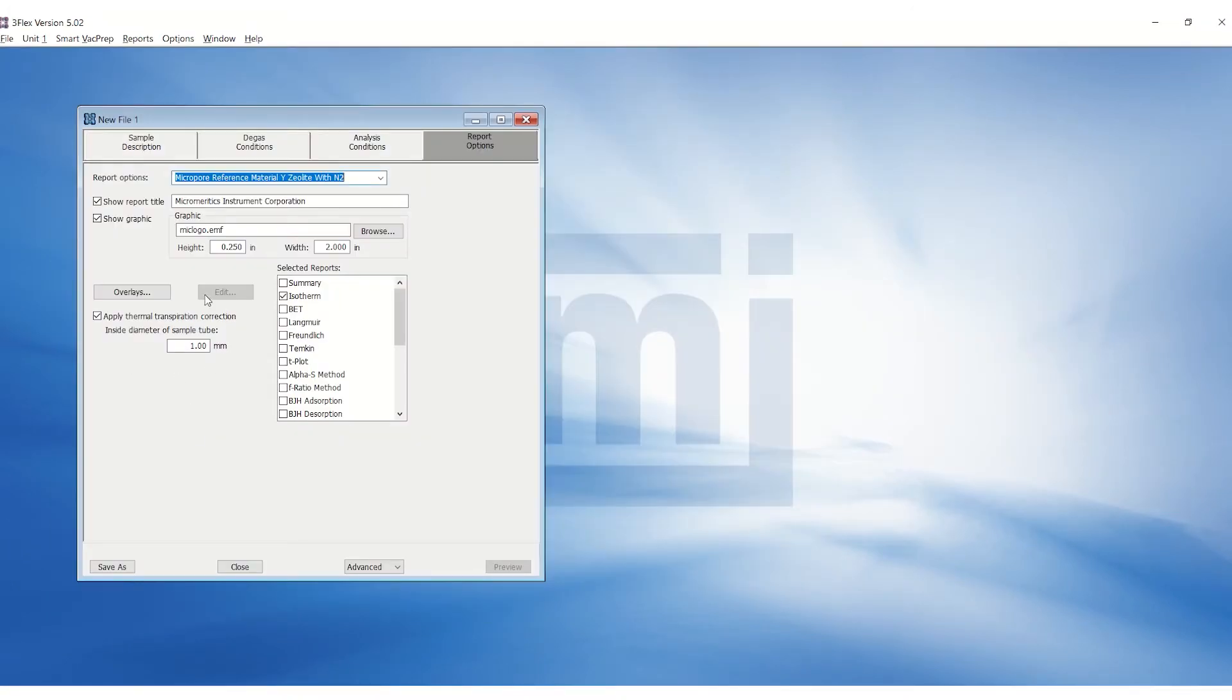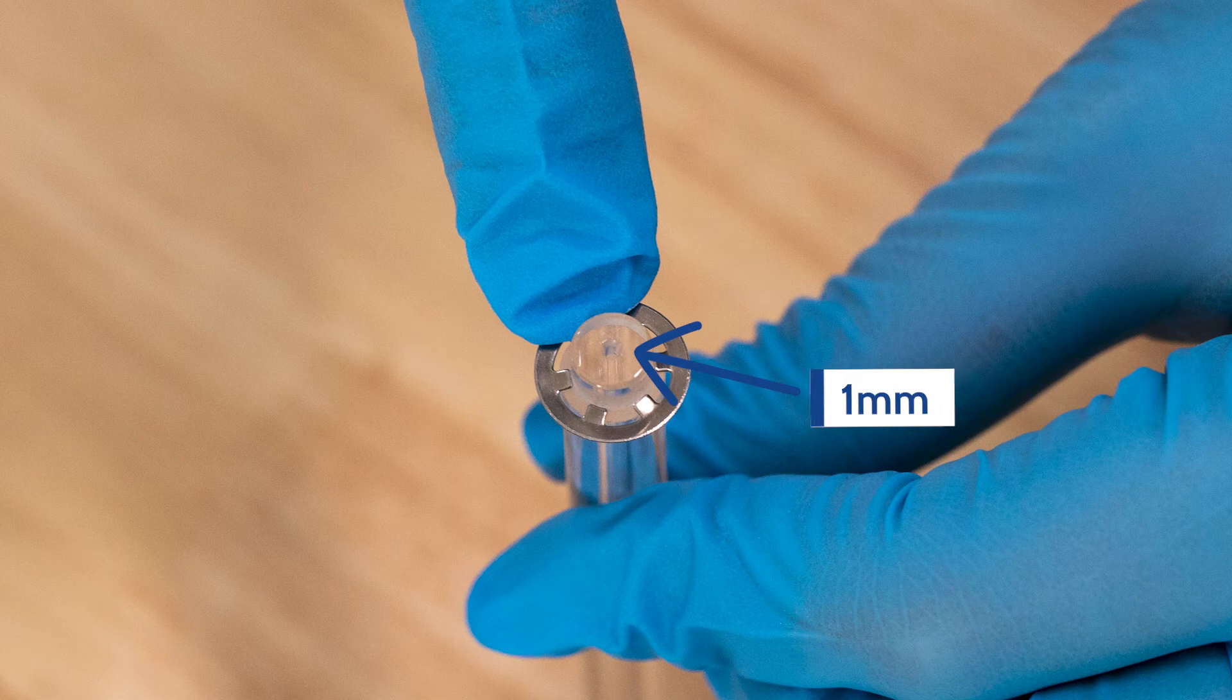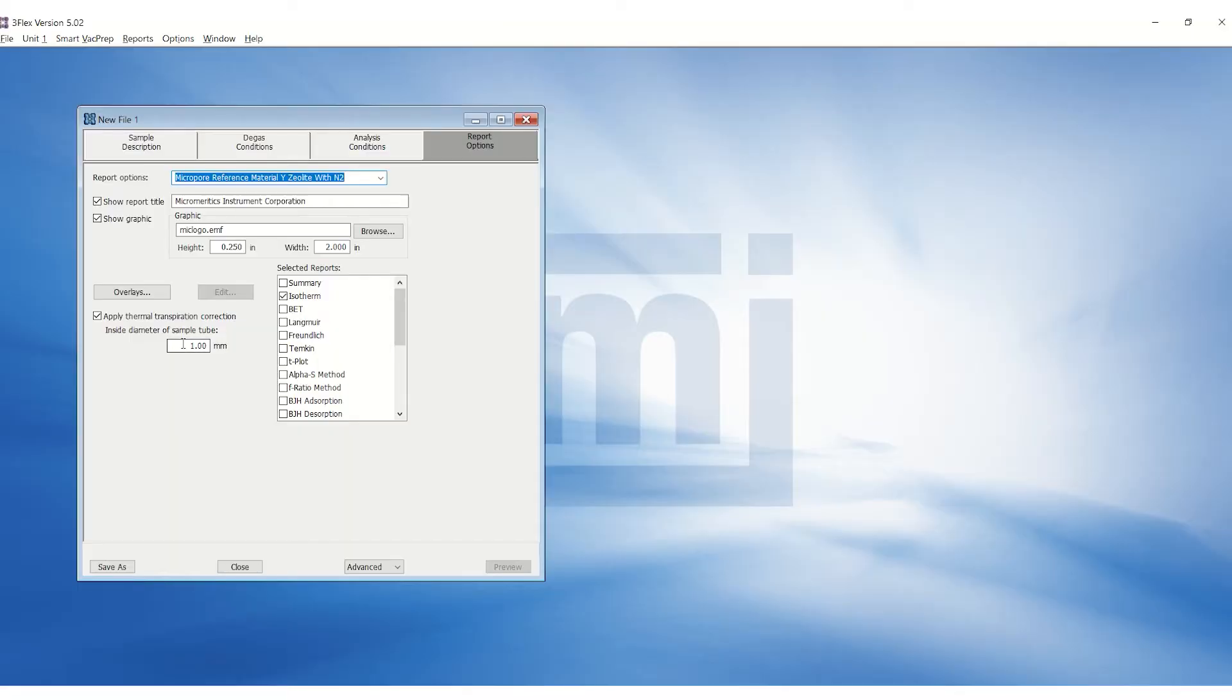Under Report Options, notice Apply Thermal Transpiration Correction inside the diameter of sample tube is checked and 1 mm is entered. 1 mm indicates the diameter of the precision hole in the hanging filler rod. When using a check seal without the filler rod, ensure to change the diameter to the sample tube diameter, which is 9 mm.